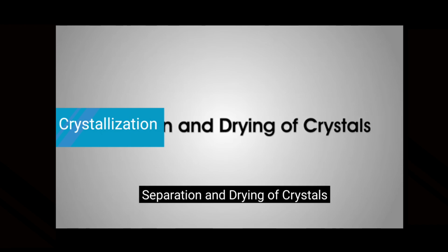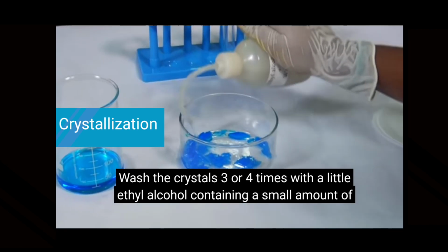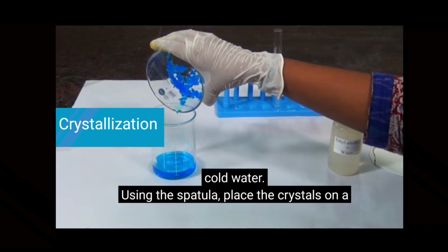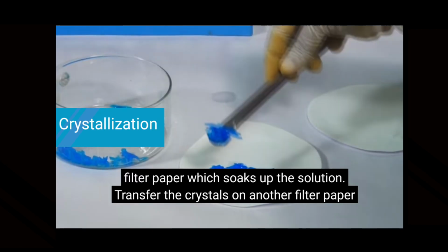Separation and drying of crystals. Decant the mother liquor carefully into a beaker. Wash the crystals 3 or 4 times with a little ethyl alcohol containing a small amount of cold water. Using the spatula, place the crystals on a filter paper which soaks up the solution.